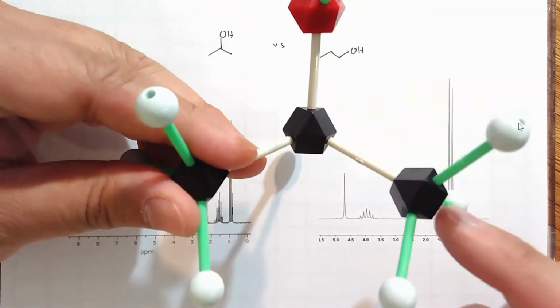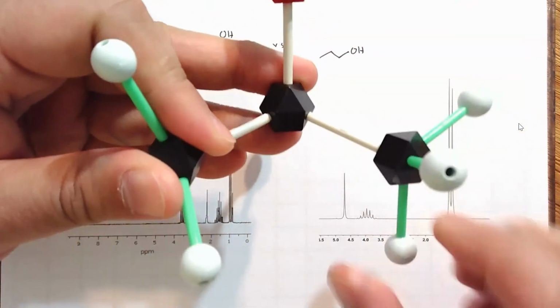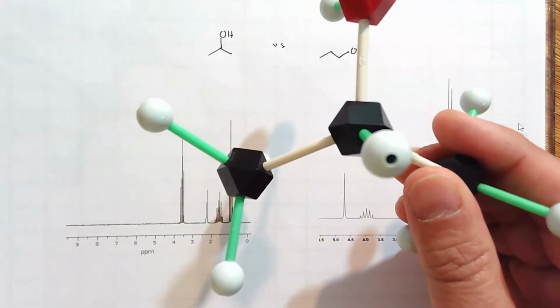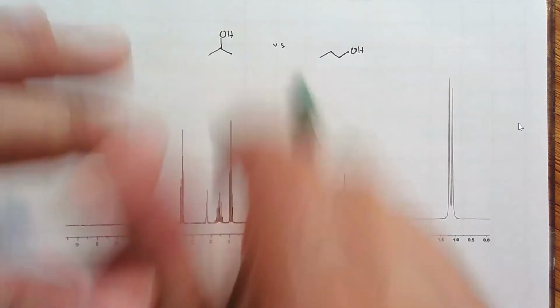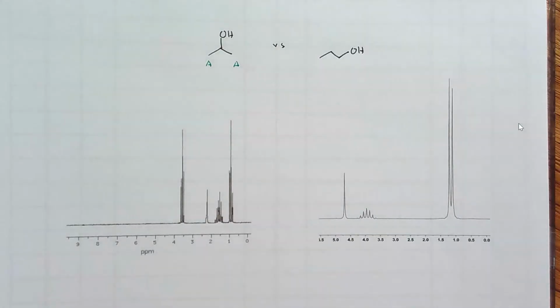But because of symmetry, these 3 hydrogens on the right also see the same things, because all I have to do is flip the molecule and I'll get the same chemical or magnetic environment as these other 3 methyl hydrogens. Long story short, these 3 protons have the same chemical environment.